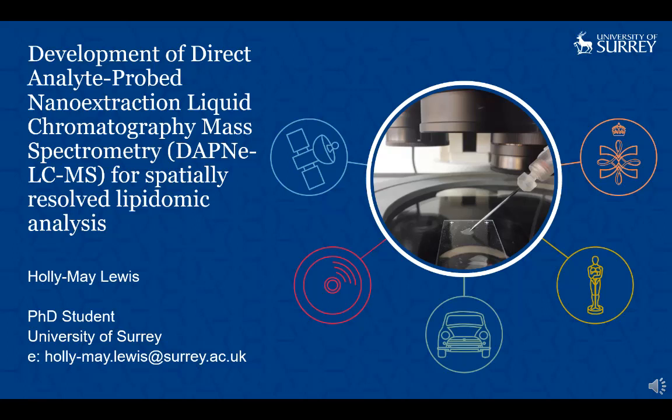I have been optimising a spatially resolved extraction technique called direct analyte probe nanoextraction, also known as DAPNe, which I have combined with liquid chromatography to analyse discrete areas of a sample. This presentation discusses the use of DAPNe-LC-MS to detect drugs and lipids at a single cell level.